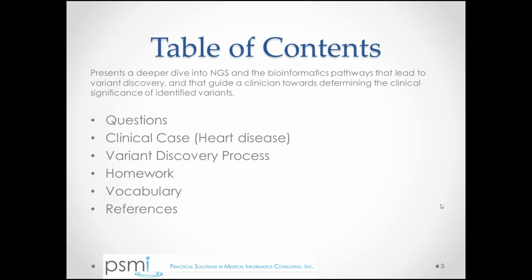We're going to examine it from two perspectives. One is next generation sequencing: what are the technical and bioinformatic aspects of discovering variants and filtering them down to identify the key causative variant? And then we're going to examine it from a clinical perspective: having focused in on the causative variant, what does it take to actually deem a particular variant to be pathogenic?